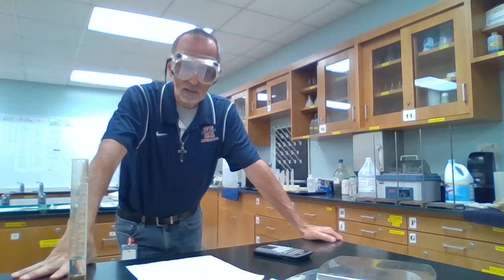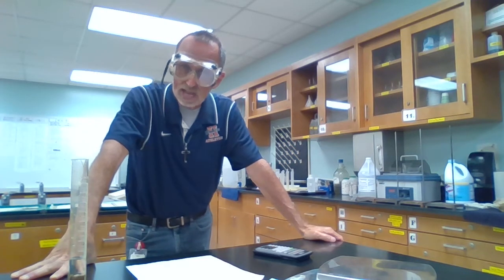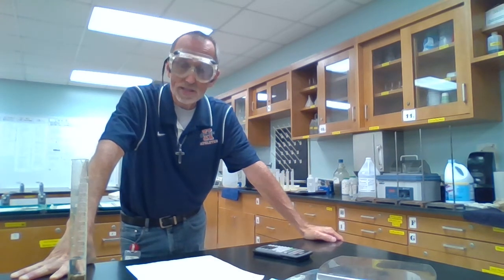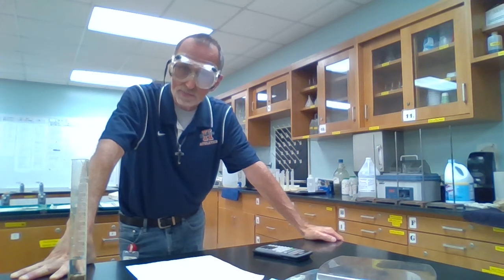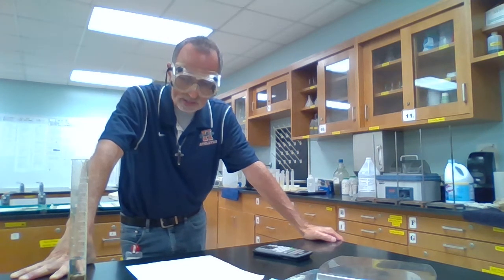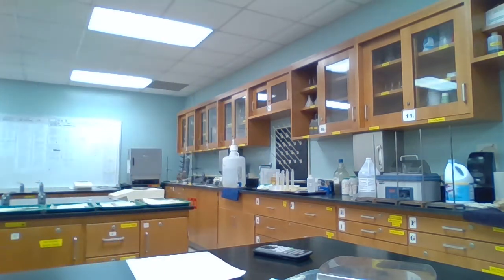Gotta love that. Yours may or may not do that exactly, but again, the volumes of the pennies really didn't change. Only the densities did, and thus the mass did. So hopefully they do come out the same both times, but even if they're off a little bit, that's certainly understandable due to measuring error. So let me get these drying.